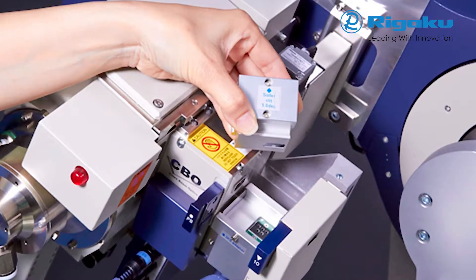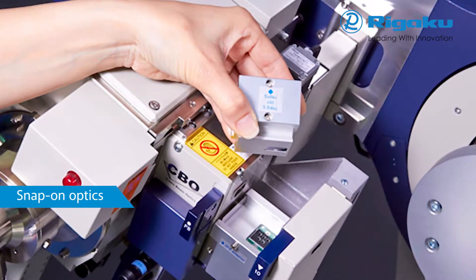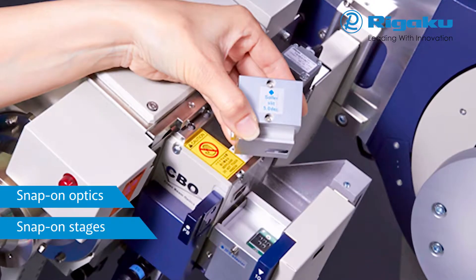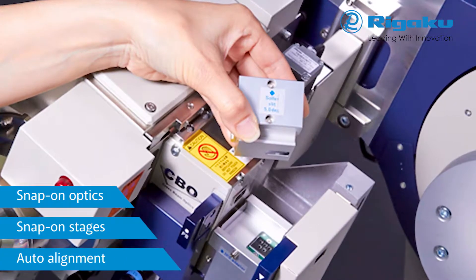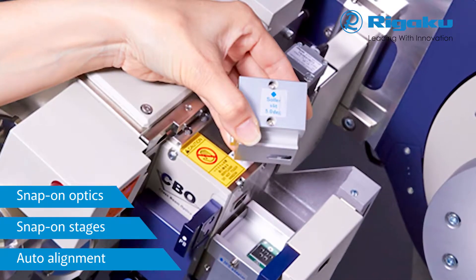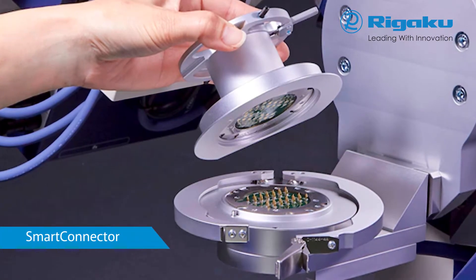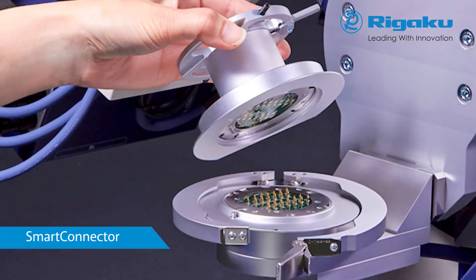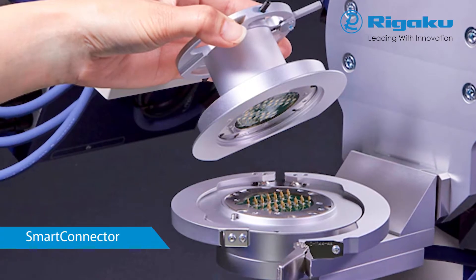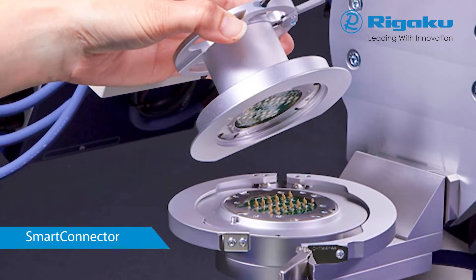Unique features abound with SmartLab SE. Optics and sample stages are snapped on and are automatically recognised by software. Optical alignment is an automatic guidance software feature. Smart Connector supplies electricity and commands to drive motorised axes on the sample attachment head, eliminating cables and maximising freedom of movement.